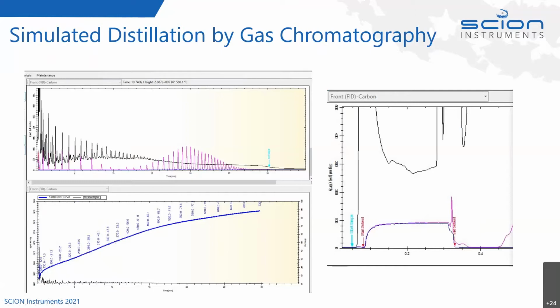But for the software itself, because it's been pre-calibrated with the pink alkane mixture, it's got the retention times of the alkanes up to C100. It can automatically process the sample and slice it for us and build the boiling point all the way up to, you see here, 730 degrees Celsius. So the blue line is the simdist plot without any DHA analysis added. This is the analysis straight away from the simdist software plugin.